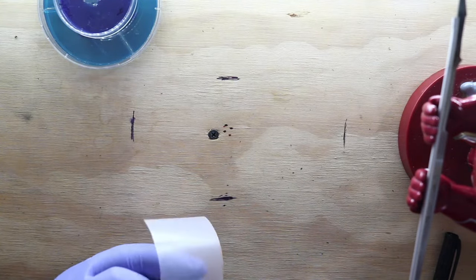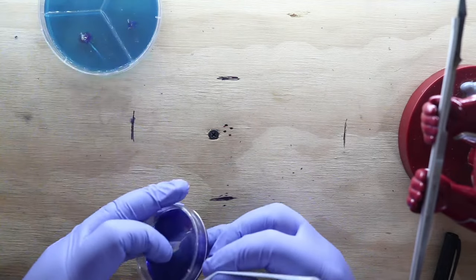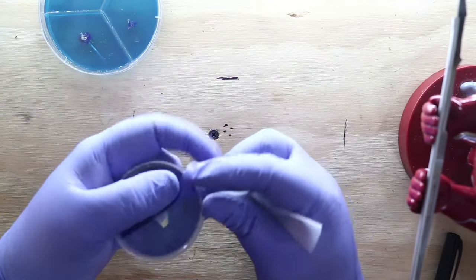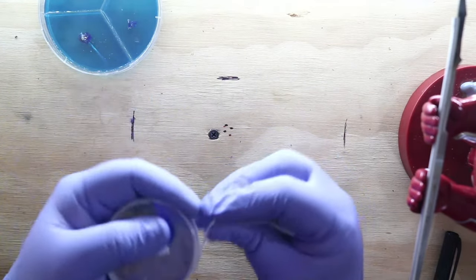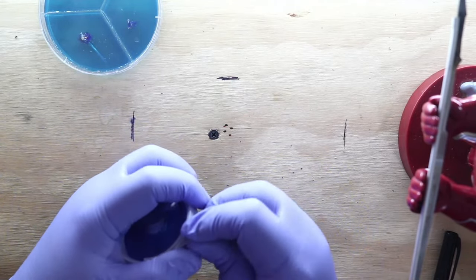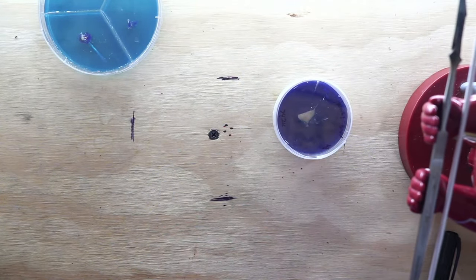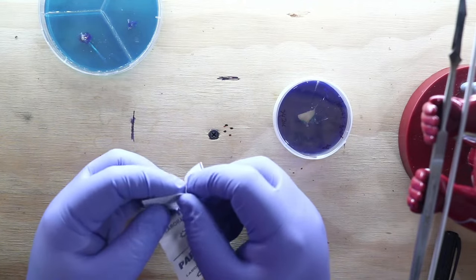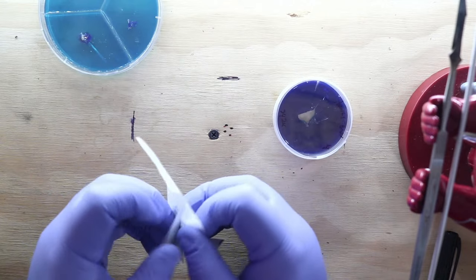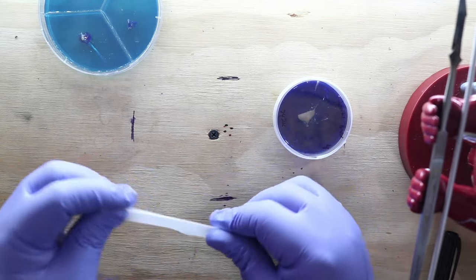Let me wrap a couple more dishes. I prefer pouring with a peristaltic pump. If I do not have a peristaltic pump, or let's say I didn't have a flow hood, the no pour is the best way to go, because you can just cook it all right in your pressure cooker, pull it out, and it's all already sealed. And then you can open it up in your still air box, and that way you don't have to pour in a still air box. But if you have a HEPA filter, pouring is my favorite.